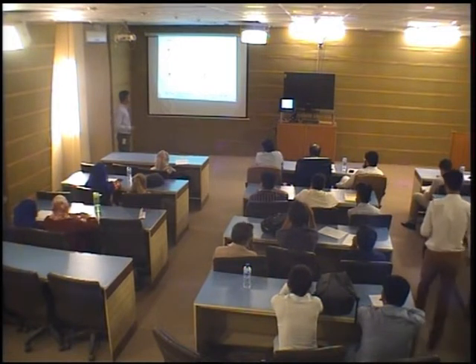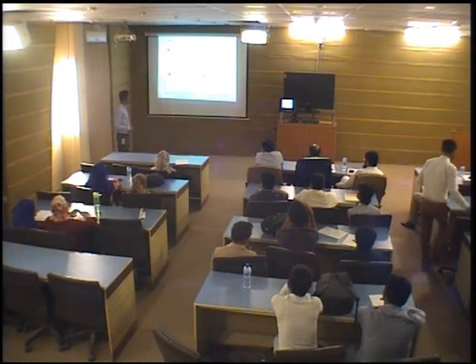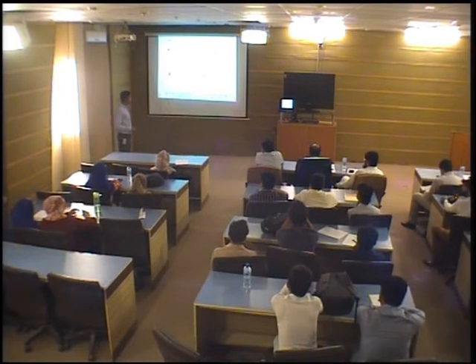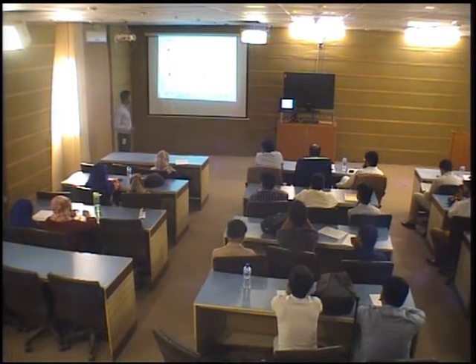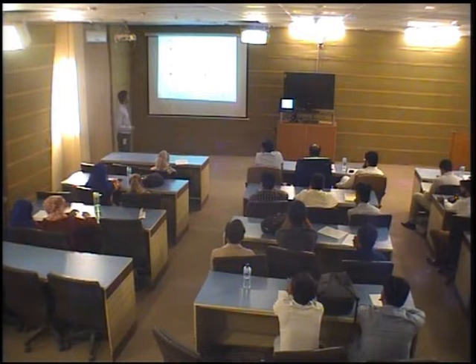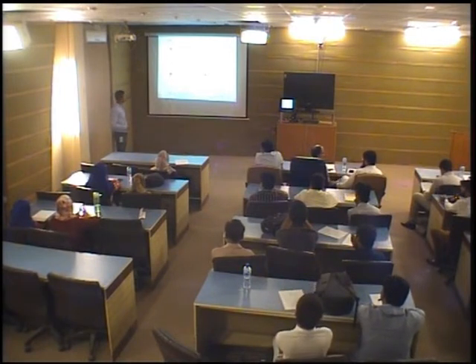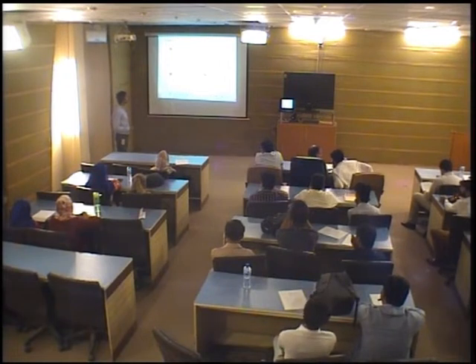In figure C, it ranges from 355 to 375. We have observed mostly lead lines. In figure D, it ranges from 392 to 408. We have observed calcium lines and lead lines. While in figure E, it ranges from 422 to 460. We have observed calcium, chromium, iron and barium.